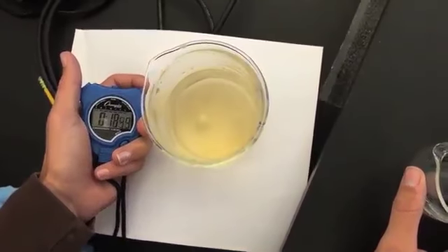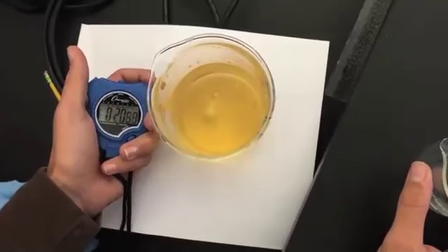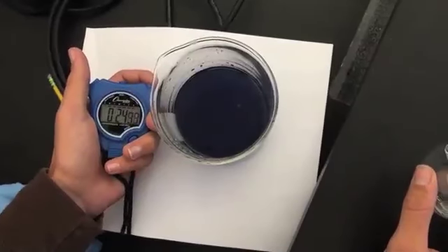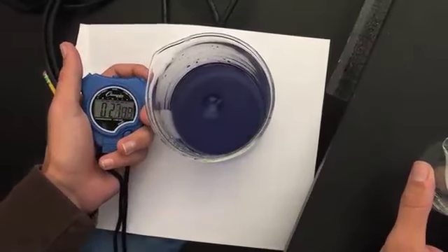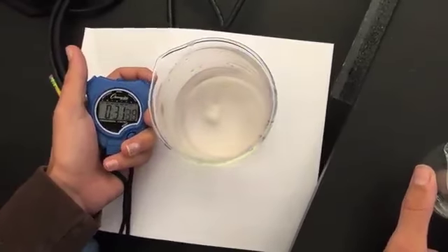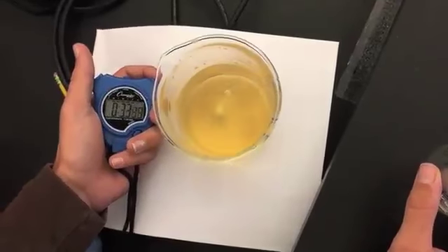As this reaction runs, the intensity of the black hue decreases as a catalyst for the yellow species reaction is generated. The solution eventually assumes a yellow hue again. This pattern occurs in a cyclic fashion for the duration of the reaction. This mechanism is known as an autocatalytic reaction.